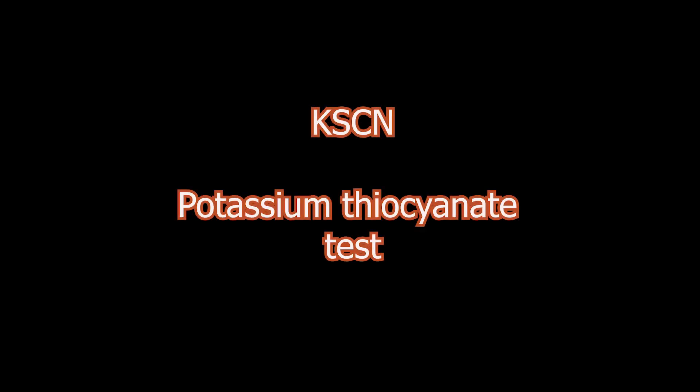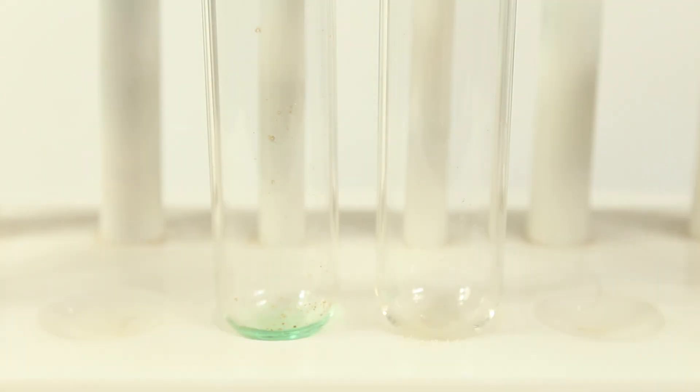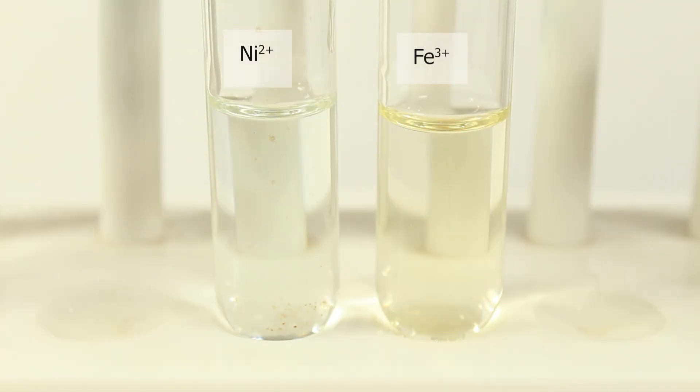Okay, for the next one. Potassium thiocyanate. Again ligand to form complexes of transition metal ions. And we expect characteristic color for iron-3 complex.